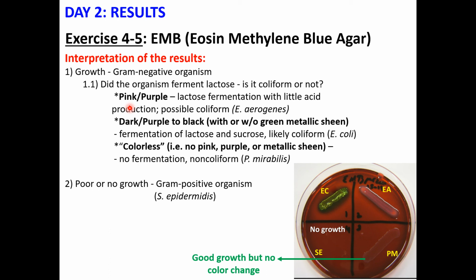Okay, so only lactose would likely be fermented, not both sugars. And that's why we don't see a lot of color change.